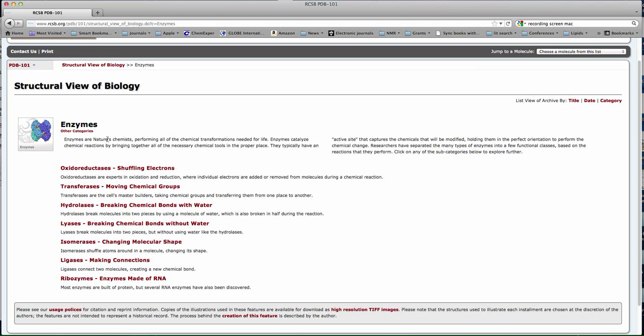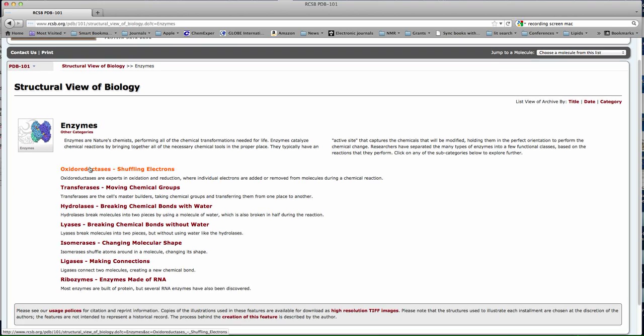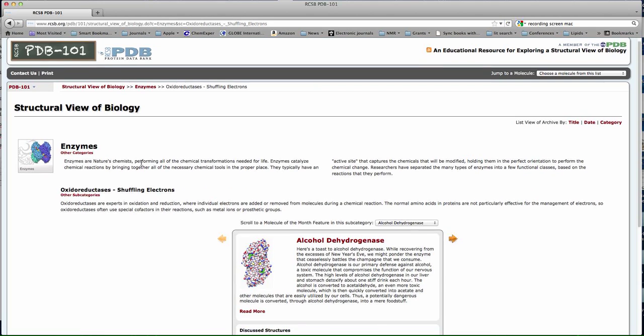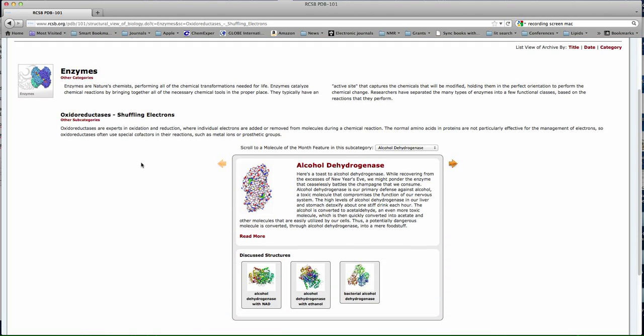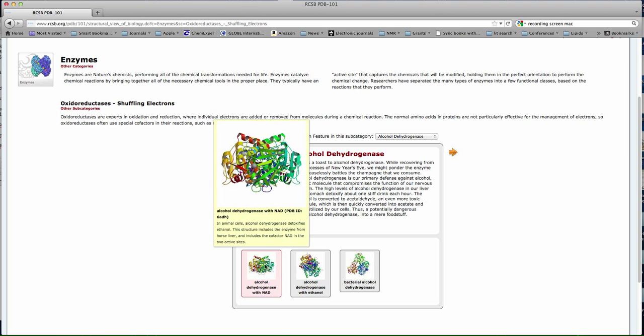Here's a whole list then of different enzymes that are types. We'll go for the top one for the minute, for example, oxidoreductases. And here we go, alcohol dehydrogenases is an example. Let's have a look at this one.